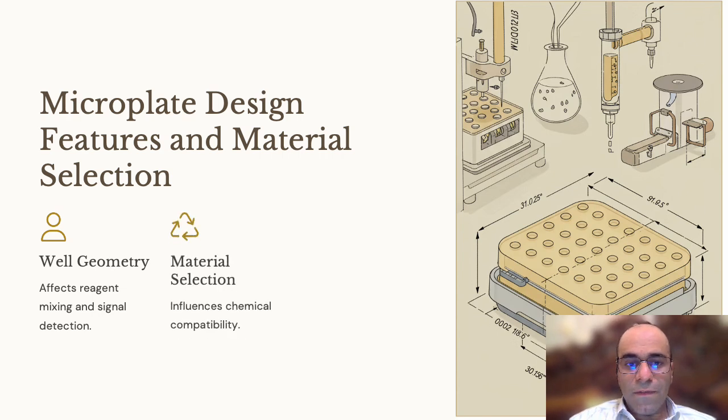The second factor is material selection, which influences chemical compatibility and background signal. Polystyrene offers excellent optical clarity for colorimetric assays, but may bind proteins non-specifically.